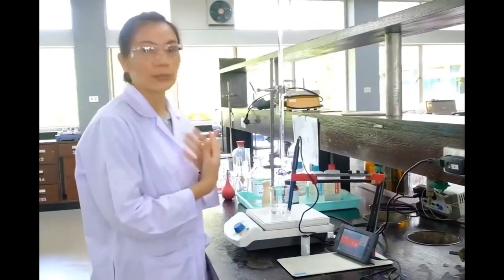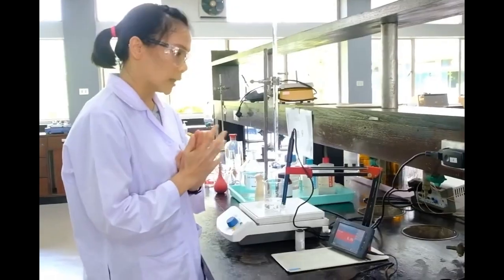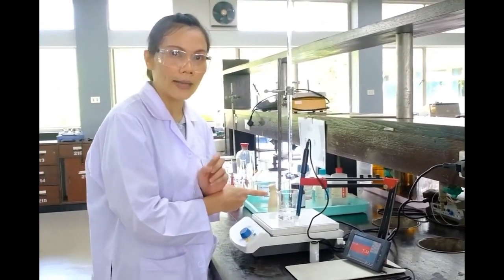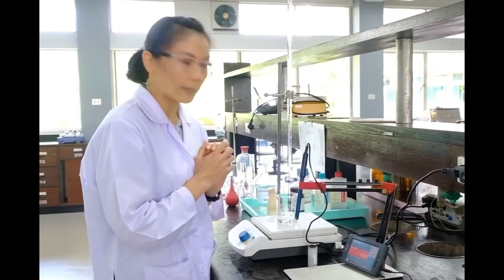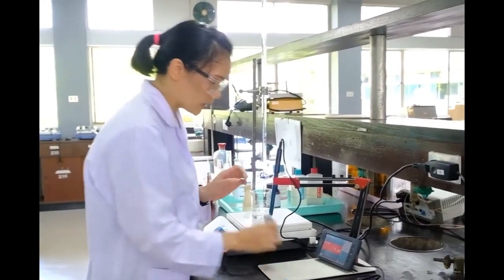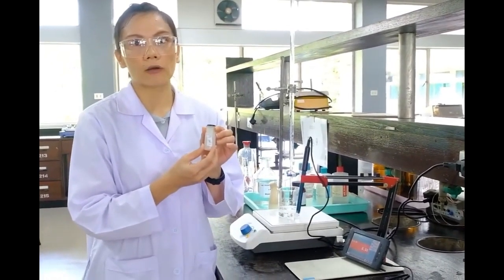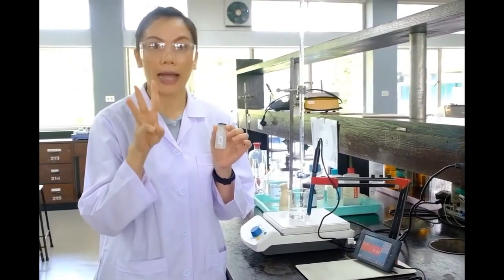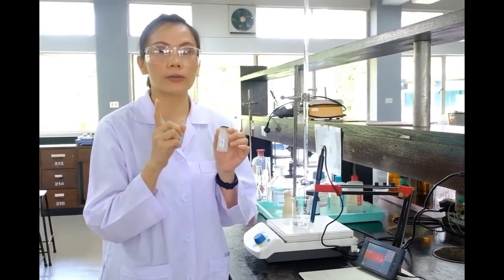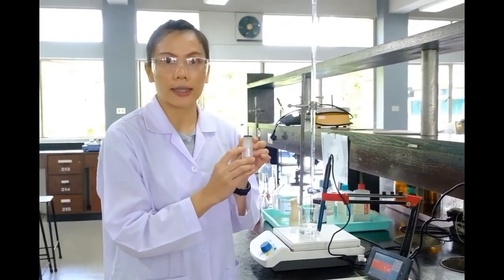After students have finished setting up the equipment, before using the pH probe to measure the pH of the maleic acid solution, students must calibrate the pH meter first, using buffer solutions. Ideally, 3 pH buffer solutions will be needed: pH 4, pH 7, and pH 9. However, today we will only demonstrate using pH 7.